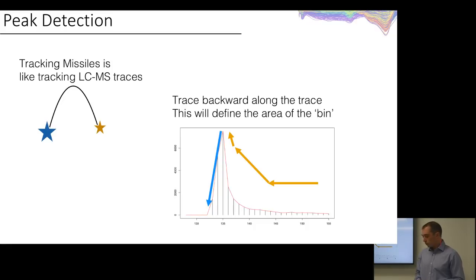So we like to detect things backwards because it's a little bit easier doing it that way. There's a slower slope on that side rather than a very high initial kickoff. And so that's exactly what we do. Once we're able to find where something goes from baseline up and then comes back down, we can find the beginning and the end of that.